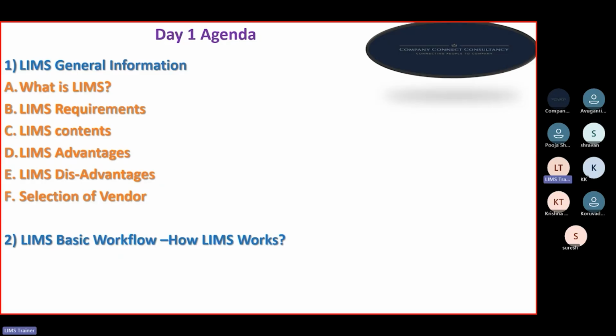The master data, like the specifications and the SOPs, are frequently changing in the pharmaceutical industry. Like, if any new drug is implemented or discovered, then the whole process will be changed. If any change control is there, then again the specification will be changed like that.